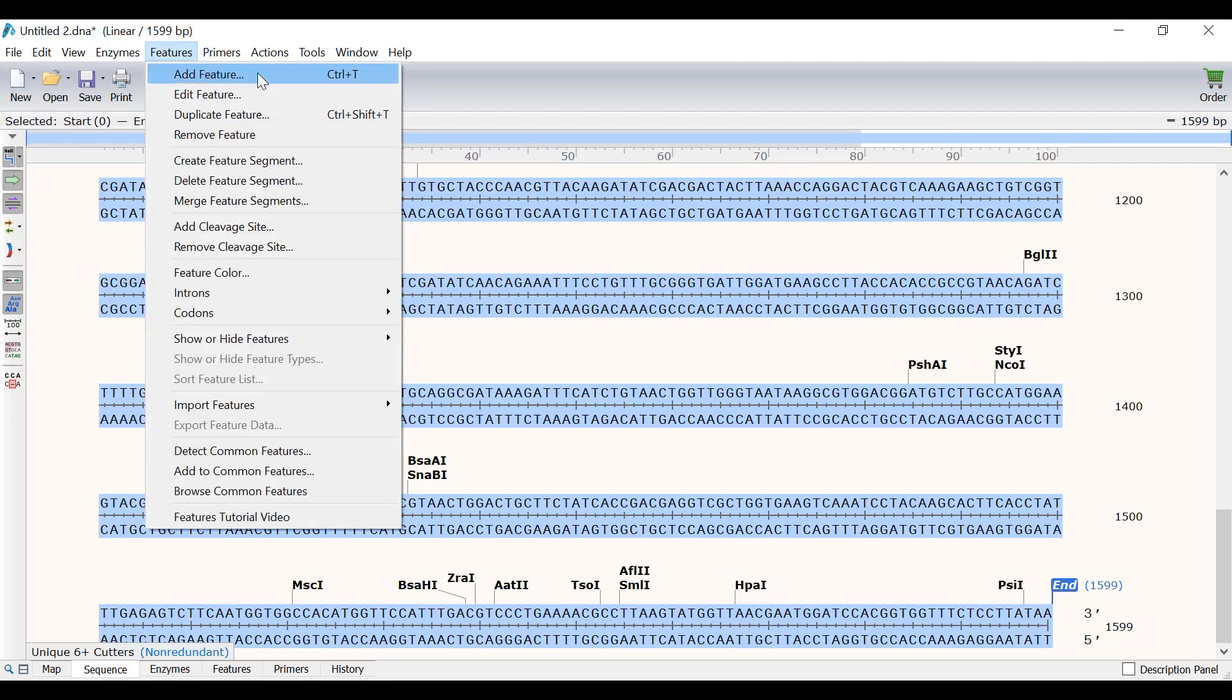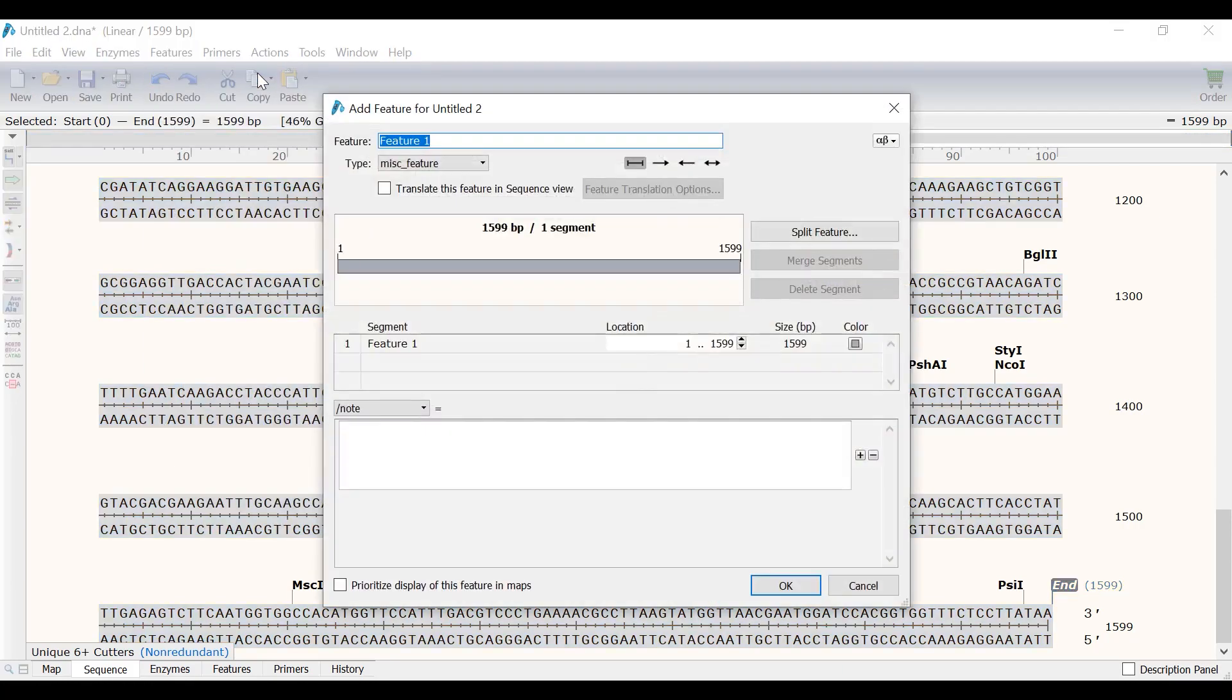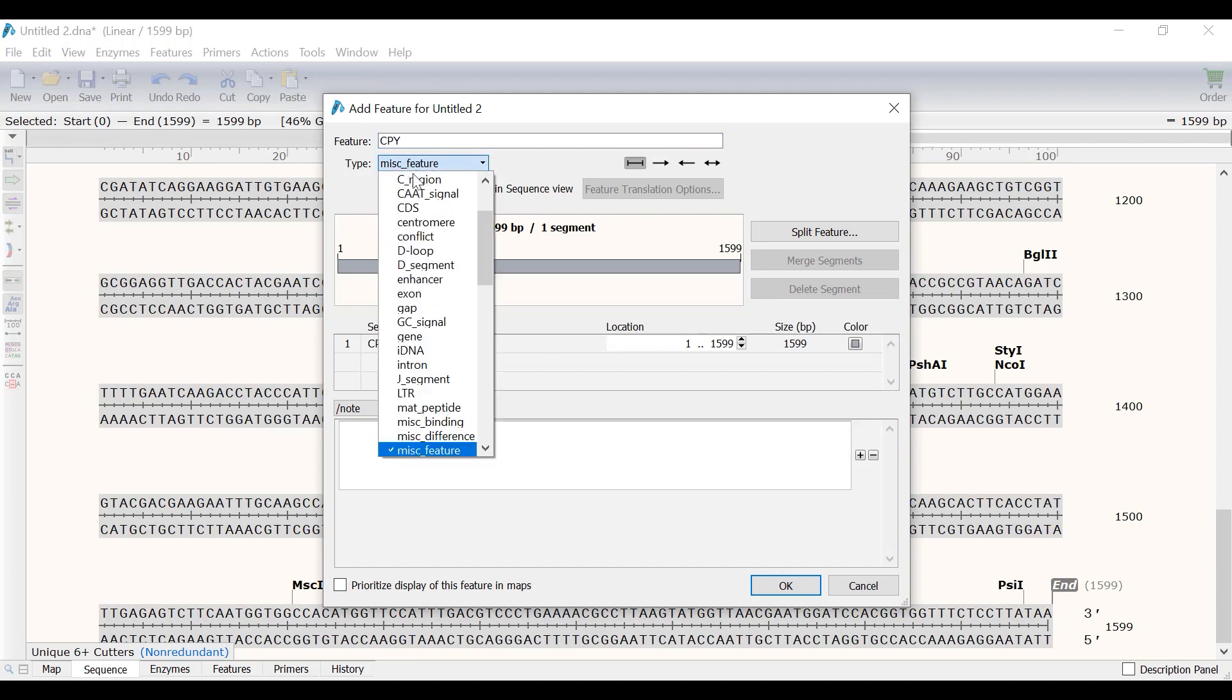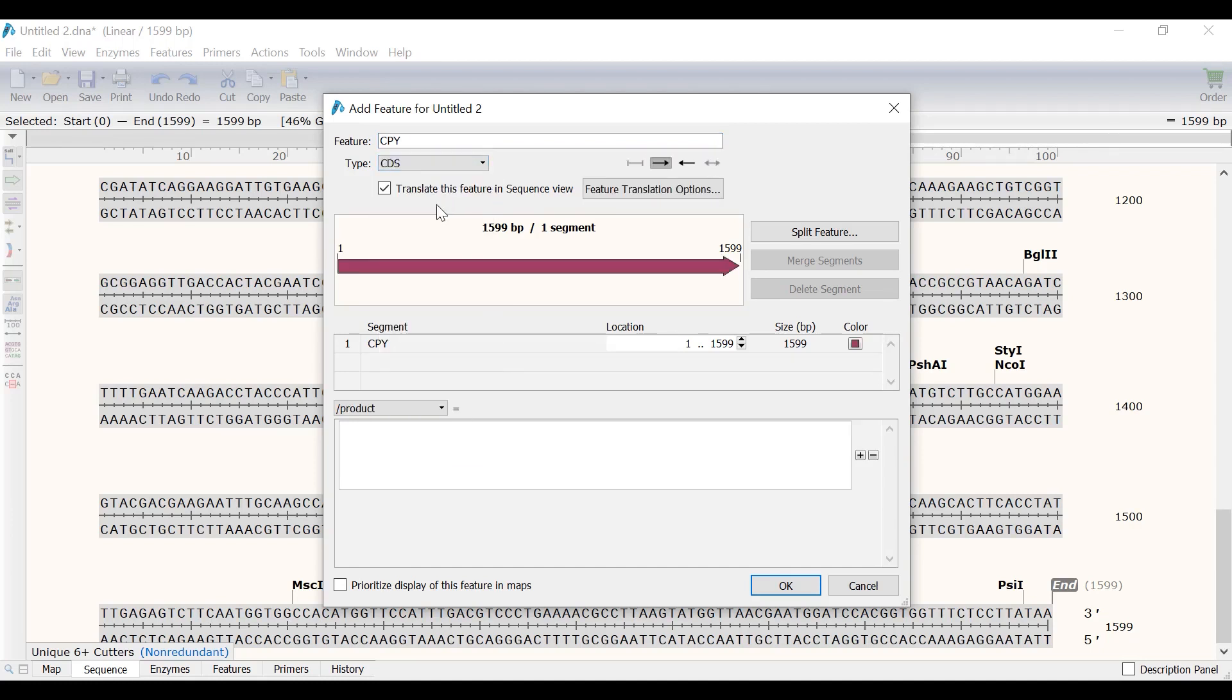Since this sequence contains the whole sequence for the CPY gene, I will call this feature CPY. The feature type will be a coding sequence, or a CDS. Note that you can use the drop down menu to specify a different feature type if you have one. Because this feature is a CDS, the option to translate this feature in sequence view has been automatically selected. This will now show the amino acid sequence in the sequence view.